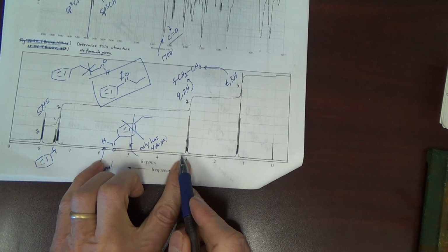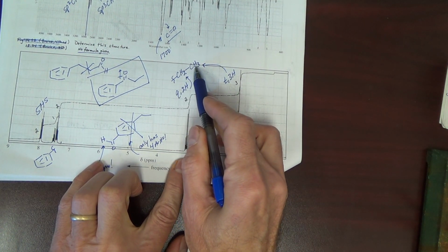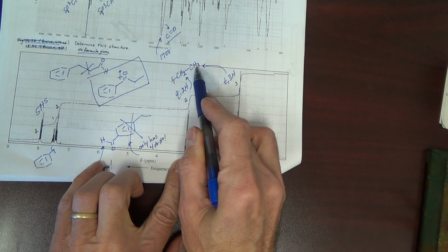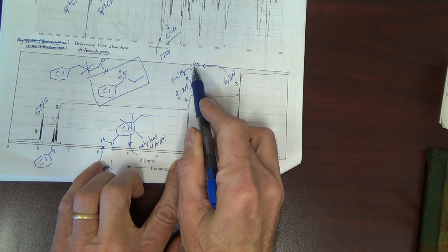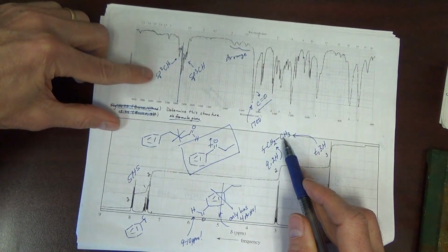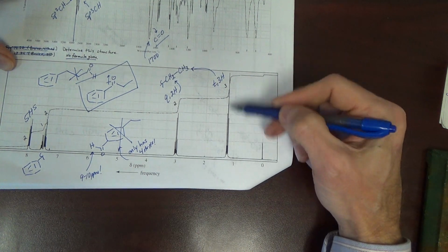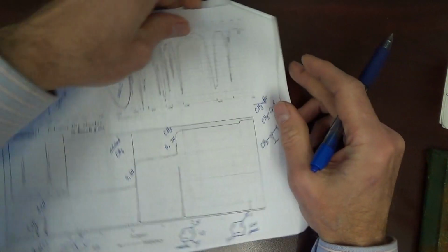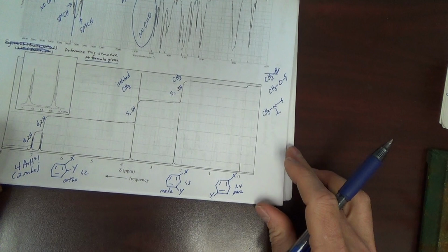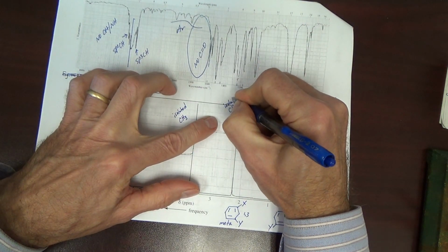See, back over here, something was splitting this signal. And so we put a CH group, or it could have been an OH group or NH group next door. But IR showed no OH or NH. And we also had this signal here, which is CH3. Isolated. But this one here is also isolated.